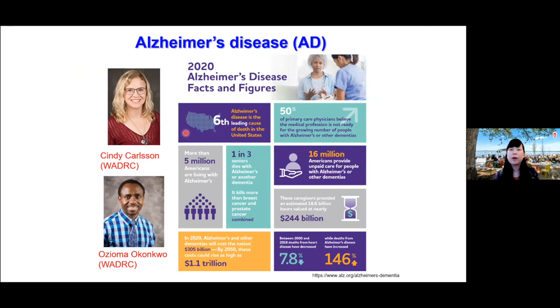The second and last application I want to tell you about is the use of DiLeu for biomarker discovery in Alzheimer's disease. AD is perhaps one of the best-known neurological disorders and is ranked the number 6 leading cause of death in the US and also worldwide. Currently, more than 5 million Americans live with this condition and there's no cure. Clearly, if we can develop an early diagnostic assay, this will help tremendously.